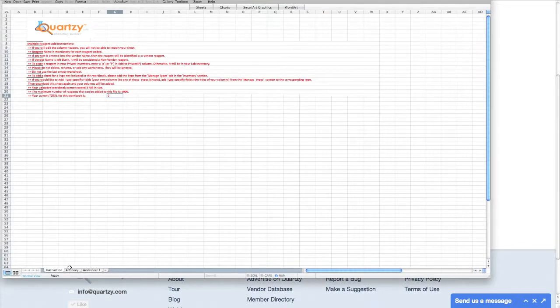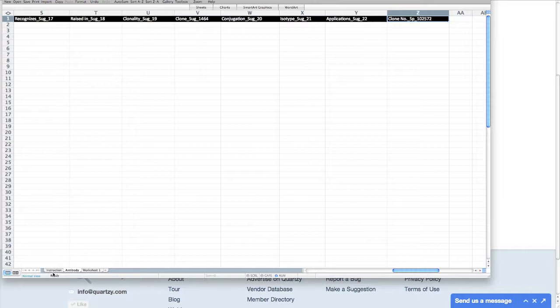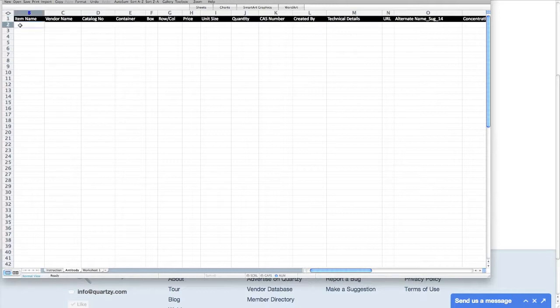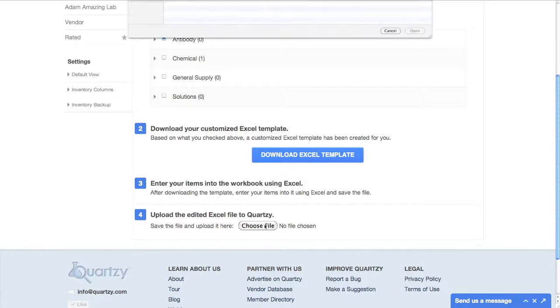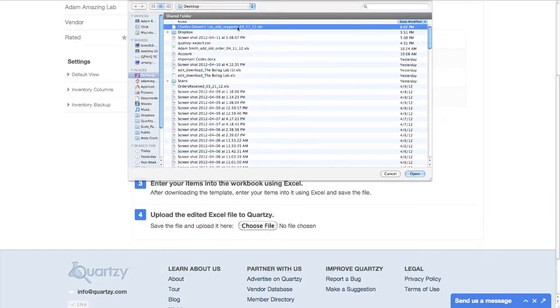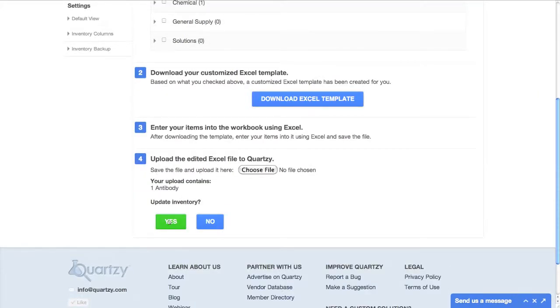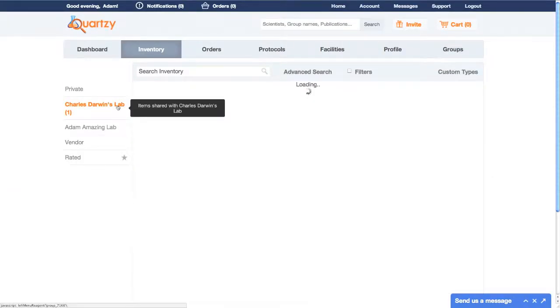Here I am in the Excel template that I downloaded from Quartsy. On the first page are instructions, and then each type I downloaded appears as an individual worksheet. If I click on antibody, I see that all the fields I care about are there, and if I scroll all the way over, I can even see the clone field I entered. I'm going to paste an antibody in here from my pre-existing database and save the file. Now I go back to the Quartsy website, scroll down to Step 4, and upload the file. Quartsy's super fancy software scans the file and then tells me it's going to upload one antibody. I say yes, and like magic, it appears in my Quartsy inventory.